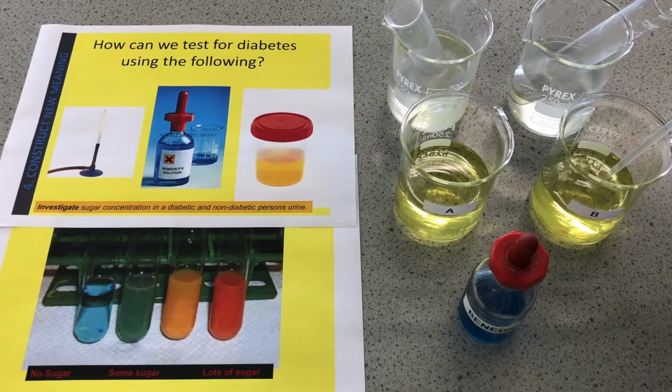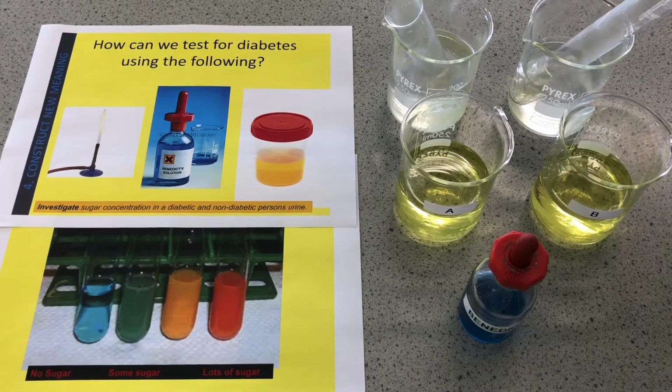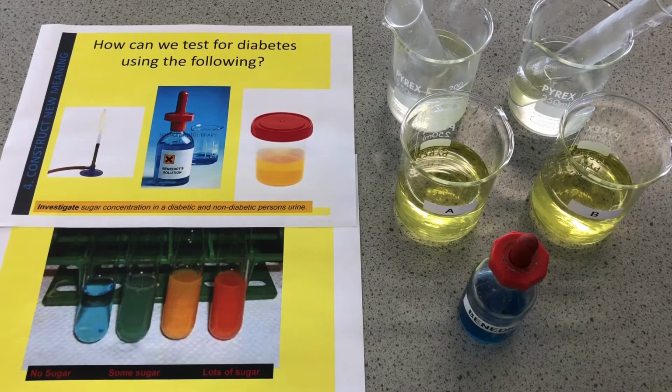So one of these urine samples will have very high concentrations of glucose, and that person is the diabetic. Okay, a non-diabetic, you would expect the glucose levels to be well controlled and monitored, the pancreas releasing that insulin, converting any of that excess glucose into glycogen, putting it into storage for when we're low on sugar, and then it can be released again.